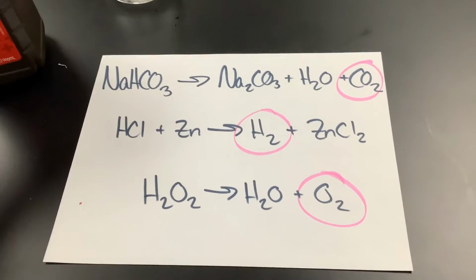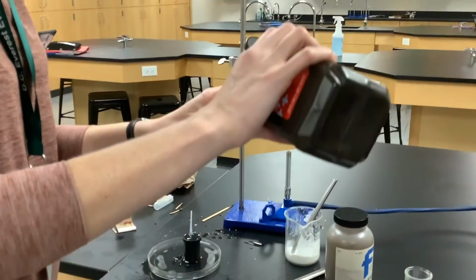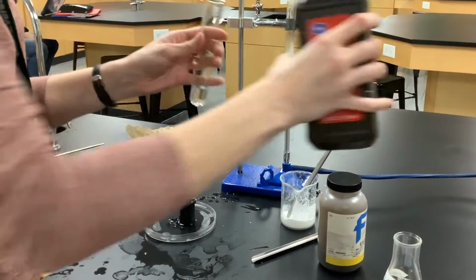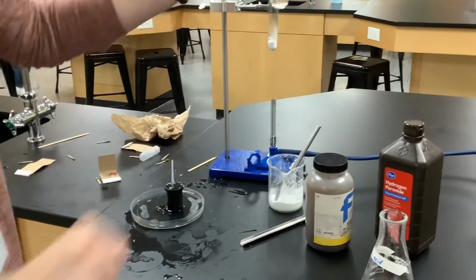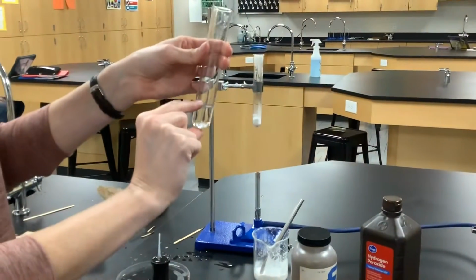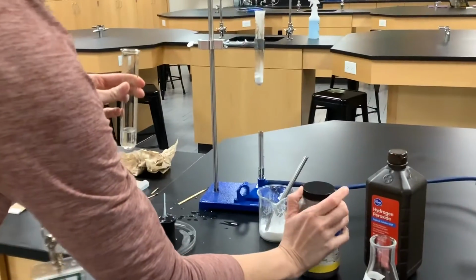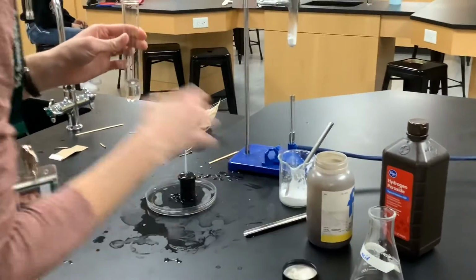So if we put it in here, that light's gonna help that reaction happen a little bit faster, but still not very fast. It's still gonna be pretty slow. We would be sitting here for a long time. So we wanna add something to make that go faster. It's not actually a reactant, it's just a catalyst that's kind of jump-starting that reaction.